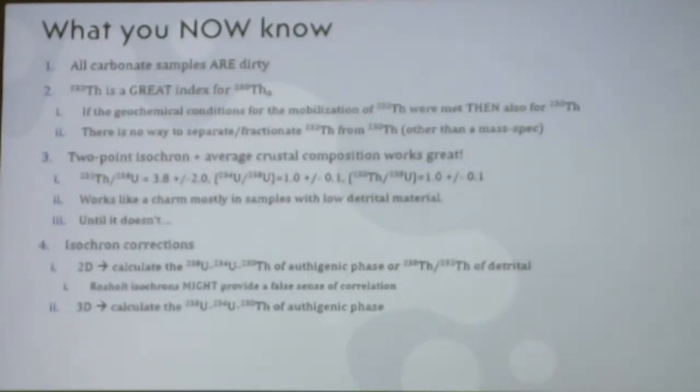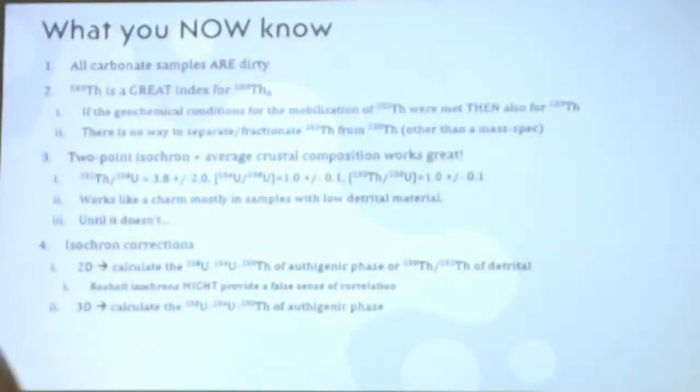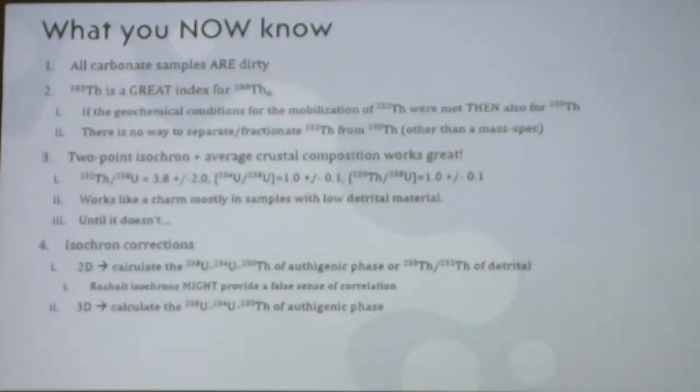If that's not the case, you have to do an isochron. Most people that I've worked with, if their samples have a lot of thorium, think, why bother? They just discuss it. I'm not like that. I like the geochronological challenges, so I recommend working with the isochron corrections and getting into it. So now you have to build an age model.